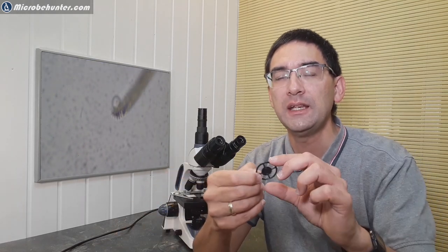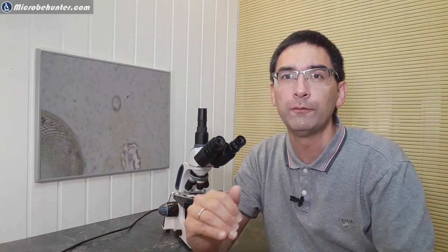And for those of you who don't know what dark field and oblique illumination are, in case of dark field, you have to insert a filter like this into the filter holder of the microscope, and then the specimens will appear to be bright on a dark background. And if you decenter this filter, that means if you rotate it out a little bit, then you will get oblique illumination. And in oblique illumination, it will appear like this, as if there is the light coming from the side, and therefore it seems to cast a shadow. The specimens seem to cast a shadow, and therefore they seem to appear three-dimensional in appearance.